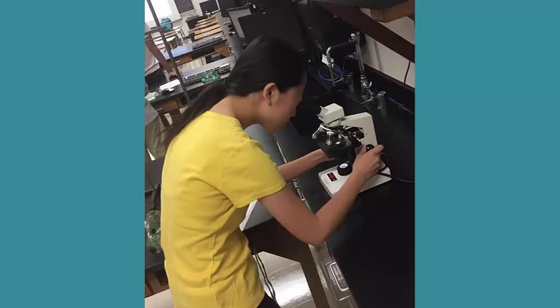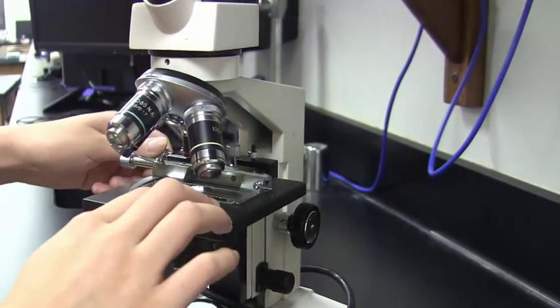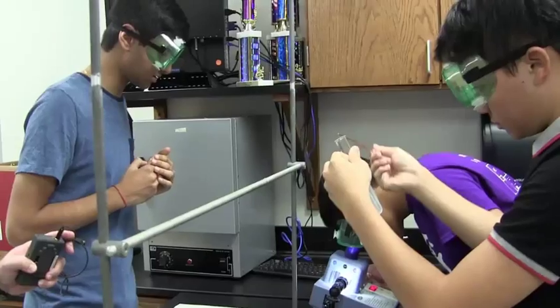And that will allow us to determine whether they're the same or whether they're different, and from that point on we can move on. So what we're going to do next is just take it to the microscope after she's done, and then we're going to compare the structures of the two compounds.